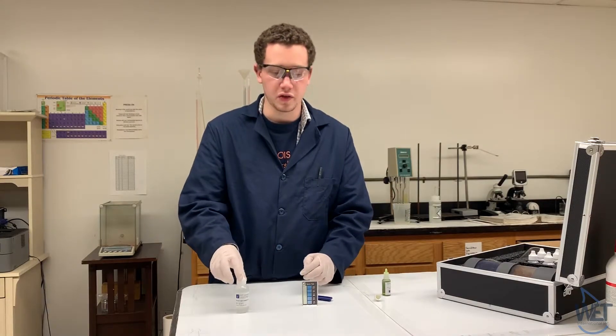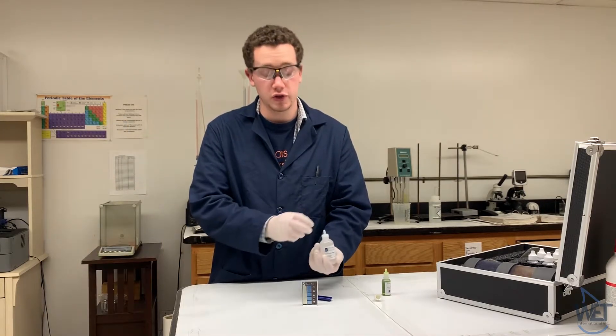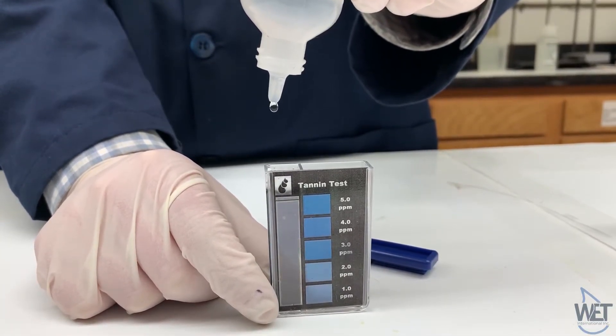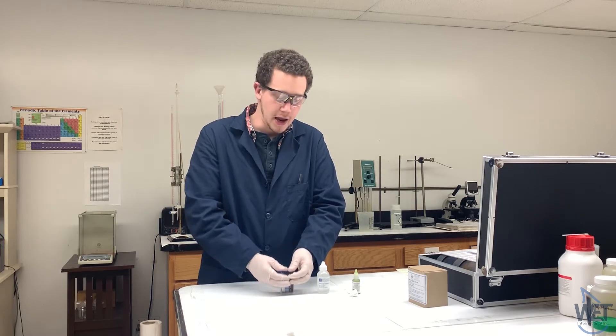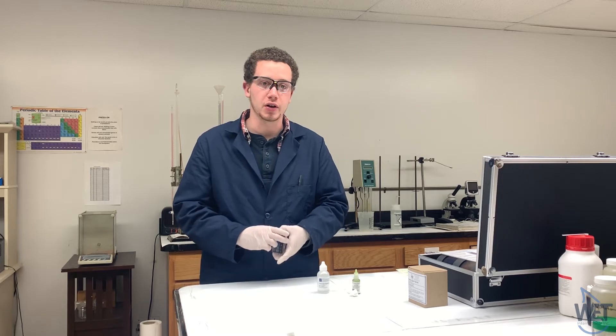Then take your tannin lignin reagent number two and add about 12 drops of that. Cap it and mix, then wait 30 minutes for color development.